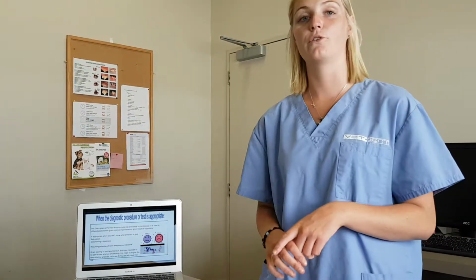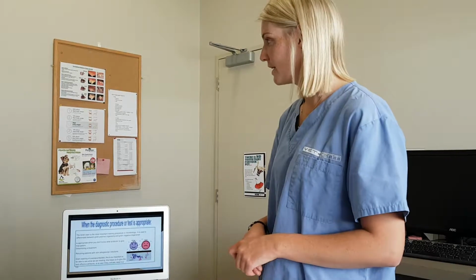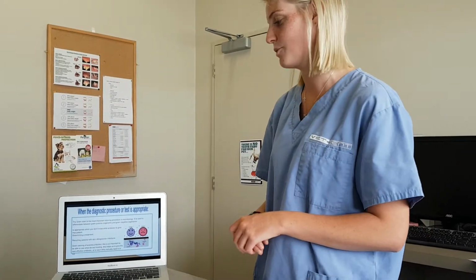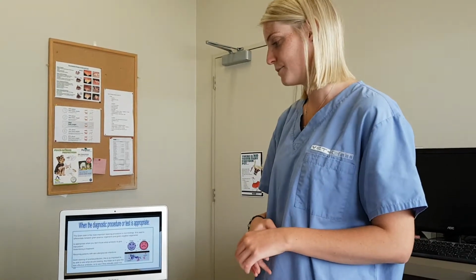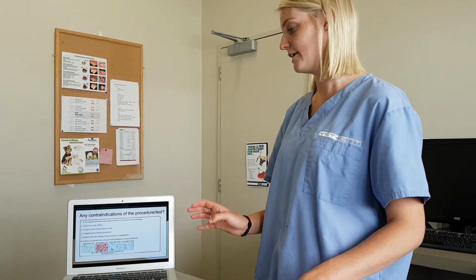Also, it's really good for recurring patients with skin allergies or ear infections. So again, doing the test to determine what antibiotic they actually need to get rid of that infection. Gram staining of snot and wounds is important to be able to see what we're actually treating. This helps us give the most effective antibiotic, or to see if they actually need it or not, like I stated before.